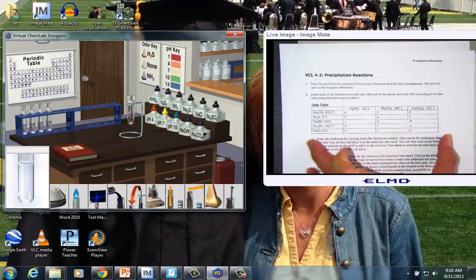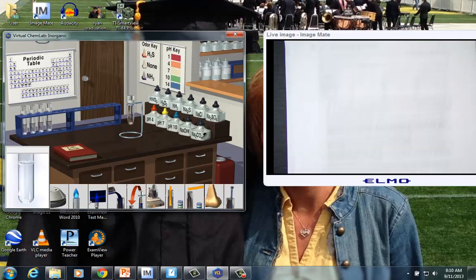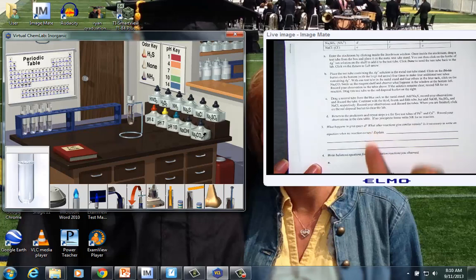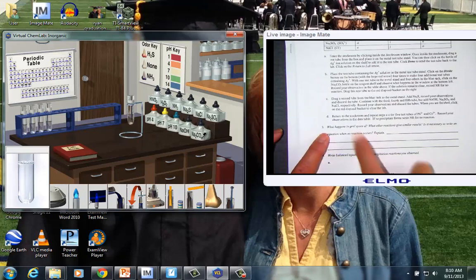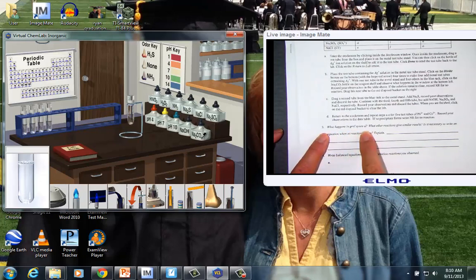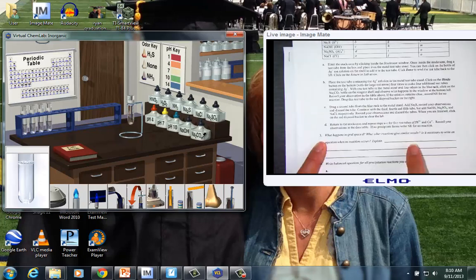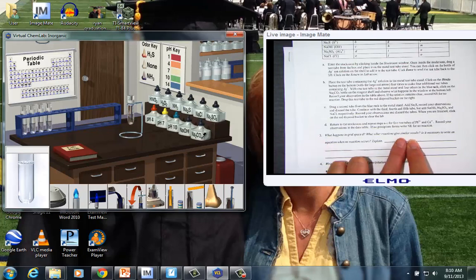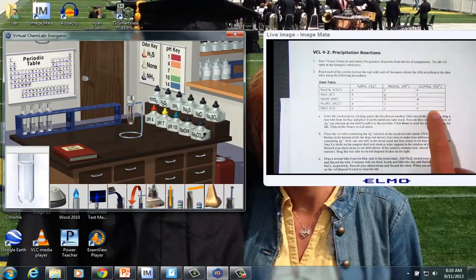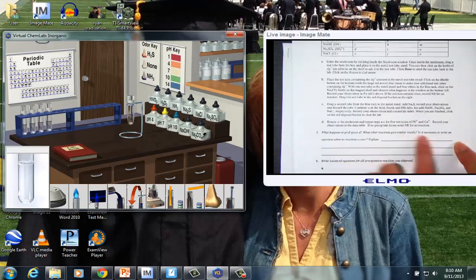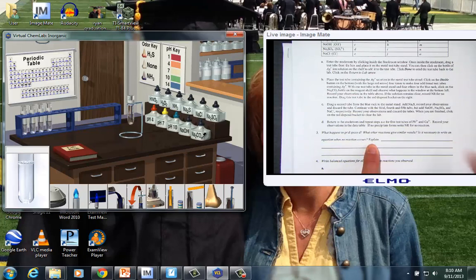Once you've completed your data table, by going back and forth to the stock room, you have questions to process. Number three, what happens in grid space D? Well, we commented already, space D was a negative test. What other reactions give similar tests? Go back up into your data table and find, where did no precipitation form? Is it necessary to write an equation for that? And the answer, of course, is no. We only write equations for positive tests.